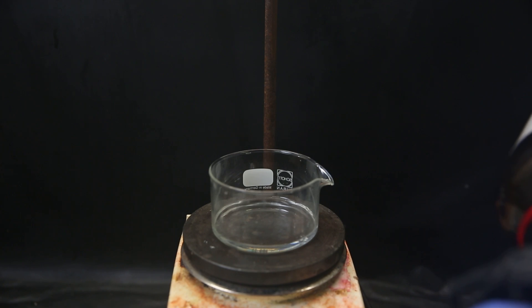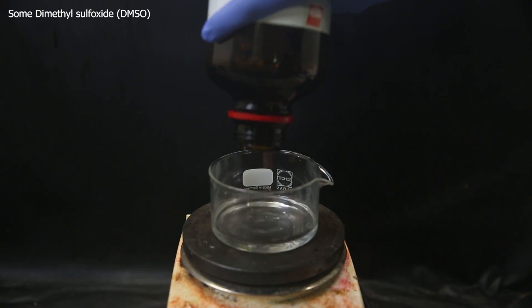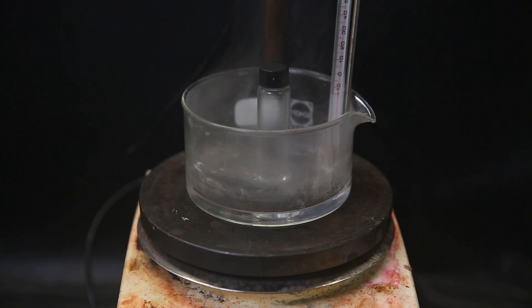The melting point is supposed to be 144 to 147°C. So I fill a small dish with some solvent that has a higher boiling point, which is dimethyl sulfoxide. I then put the temperature probe into the liquid and start heating it.